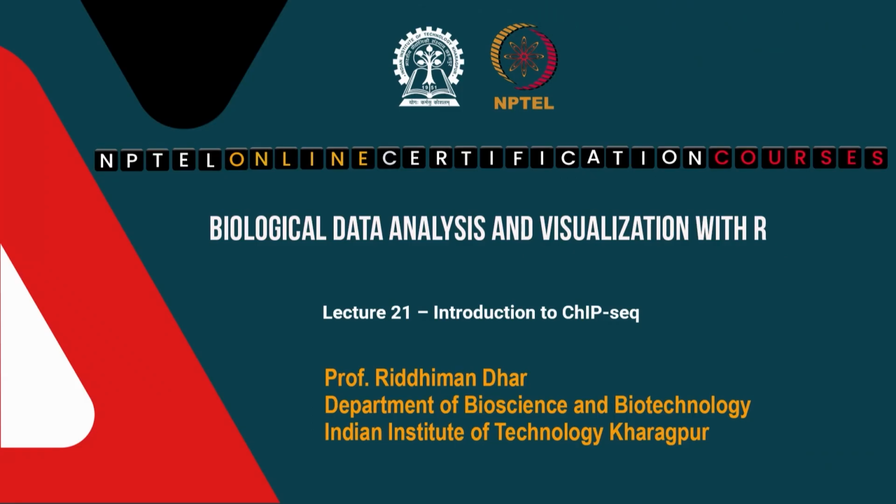What we will do is first talk a little bit about what ChIP-seq is and why you do ChIP-seq. That is the topic for this class, and then we will again take some hands-on problems, which we will solve through this week. In this class I will very briefly introduce the ChIP-seq method, and then I will talk about the data analysis steps.